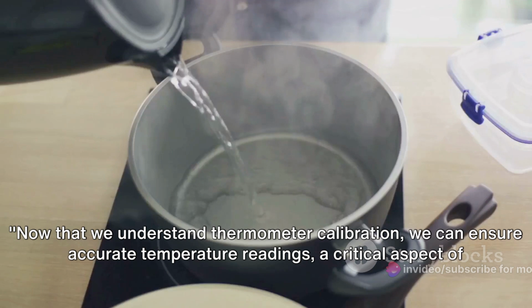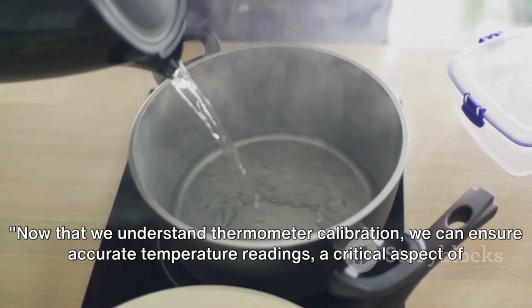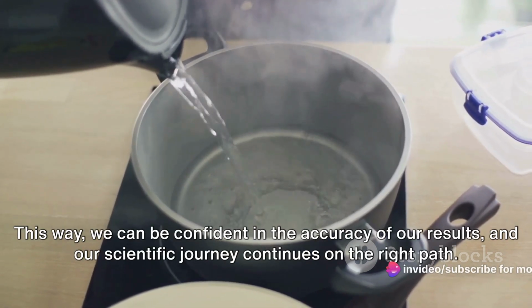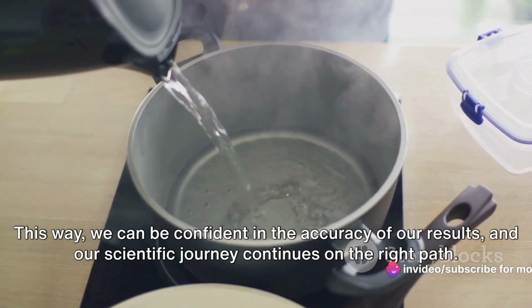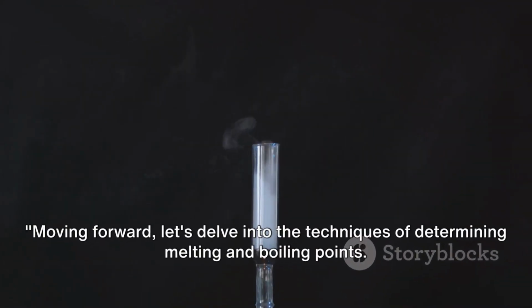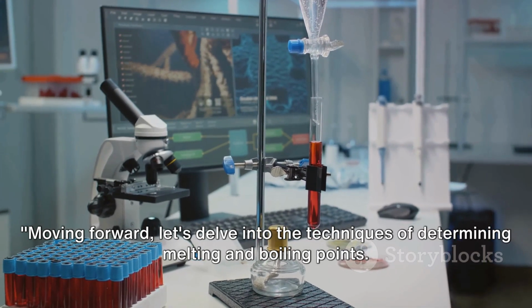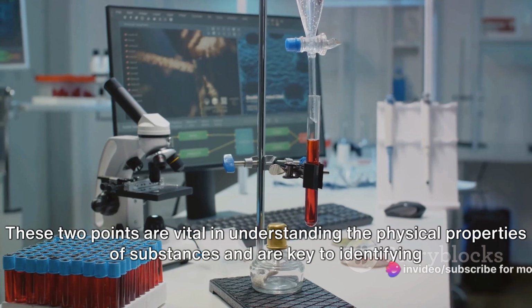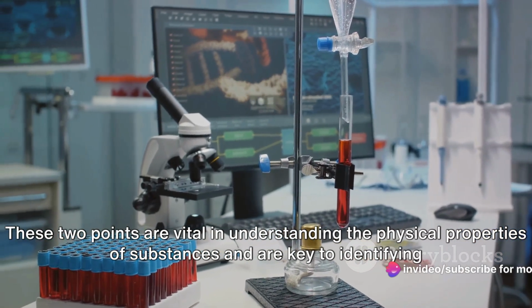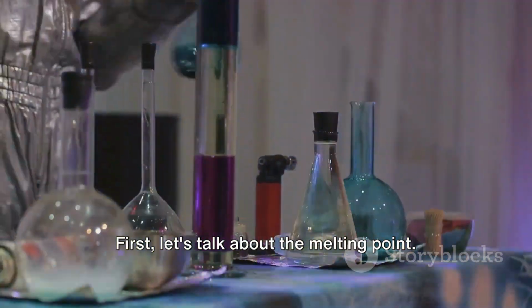Now that we understand thermometer calibration, we can ensure accurate temperature readings, a critical aspect of many experiments. This way, we can be confident in the accuracy of our results, and our scientific journey continues on the right path. Moving forward, let's delve into the techniques of determining melting and boiling points. These 2 points are vital in understanding the physical properties of substances and are key to identifying unknown substances in the laboratory. First, let's talk about the melting point.